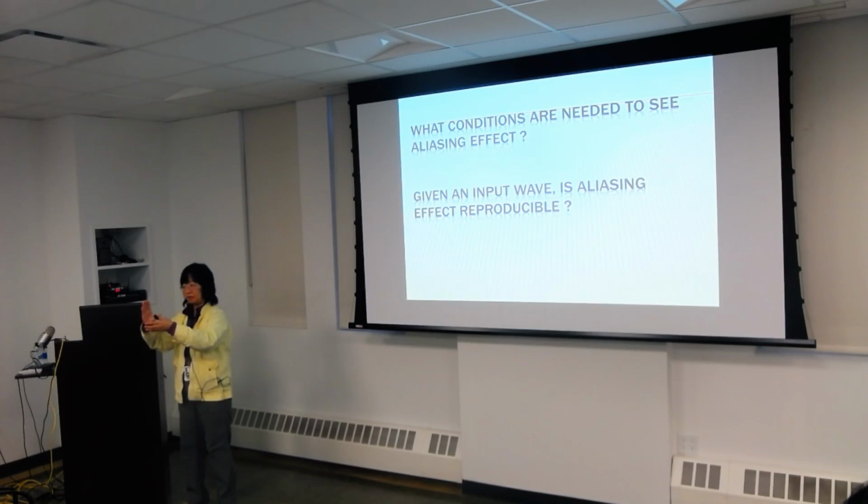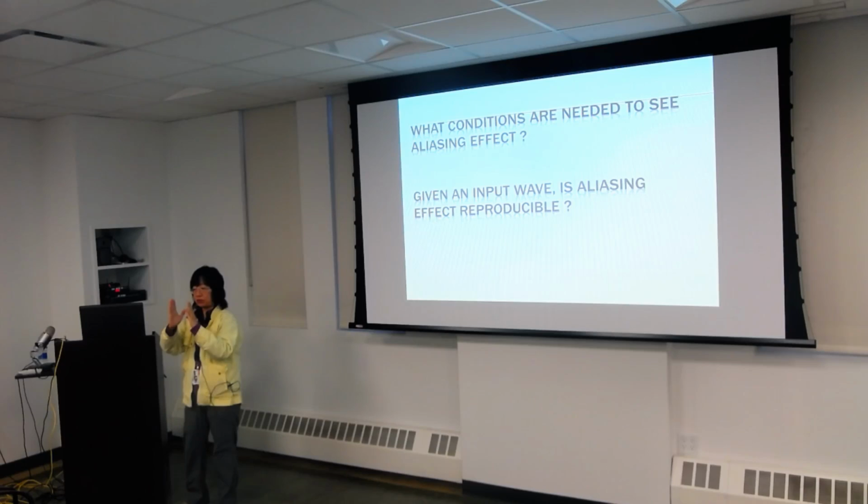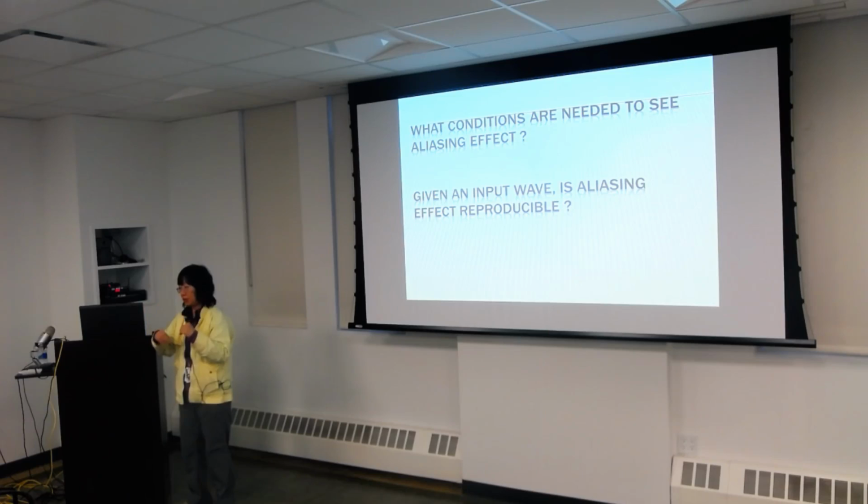Theoretically, yes. Your cutoff is absolute, yes. Yeah, if your cutoff is absolute at a certain point, then it should always come back in the same way. Because remember, what we did was just two sine waves, right? I got it only for one sine, and I'm going to fix it with the exact equation every time. It's all going to give me the same amplitude, the same phase every time, no matter what. So aliasing is actually a mathematical effect. Okay, it's not because I got some noise and then it started doing something weird to my image. So that's something that you should realize. So that will happen every time.